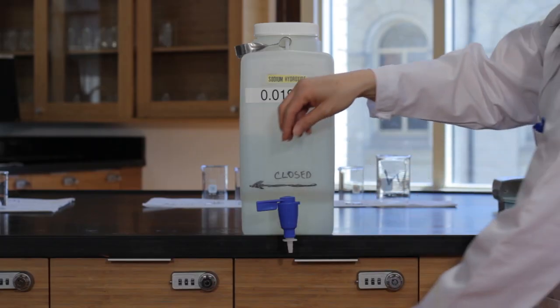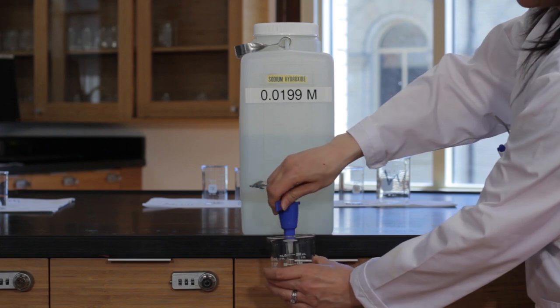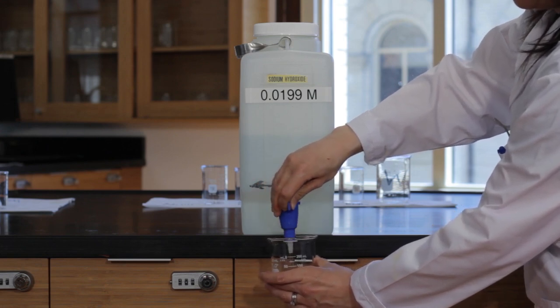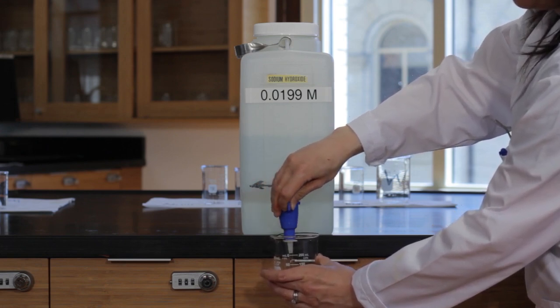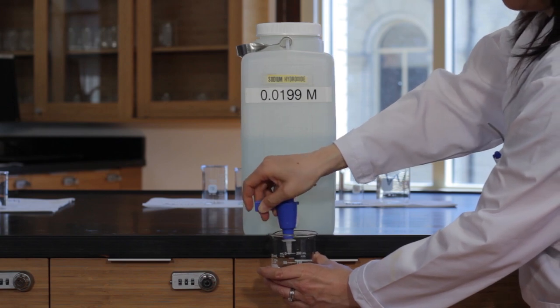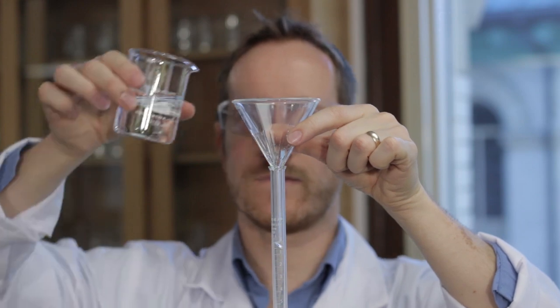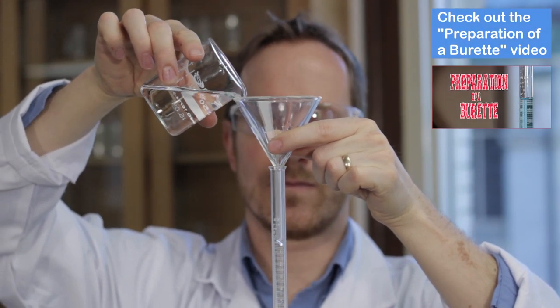Transfer some of the sodium hydroxide from the main source into a clean, dry, medium-sized beaker. Record the concentration of the sodium hydroxide solution. Prepare the burette as demonstrated in another video using the sodium hydroxide solution.